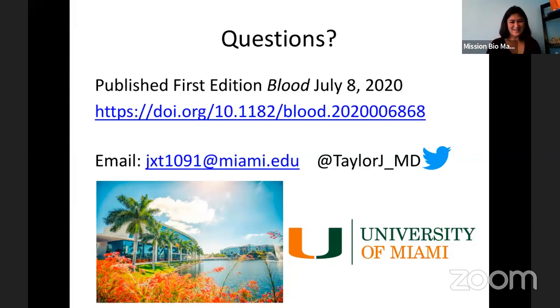We have a nice comment. So they said, very nice talk. I understand there were technical difficulties sequencing the SRSF2 mutations on Tapestry. Can you comment on these and whether you managed to overcome them? If not, do you think they're surmountable on this platform? Yeah, thanks for that question. It's a great question. Actually, if you go to the paper, we talk a lot about that and have some experiments in the supplement where we delineate that.